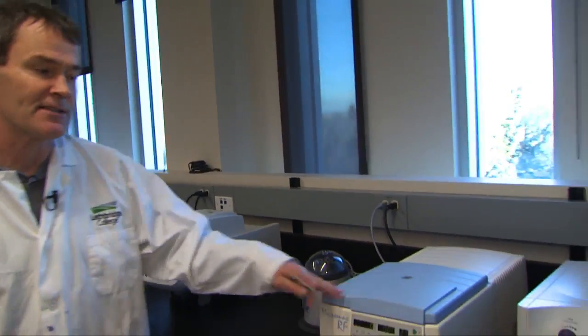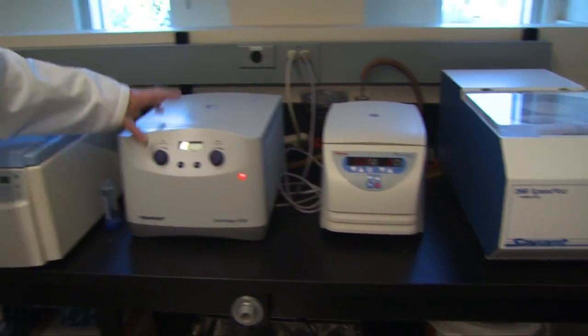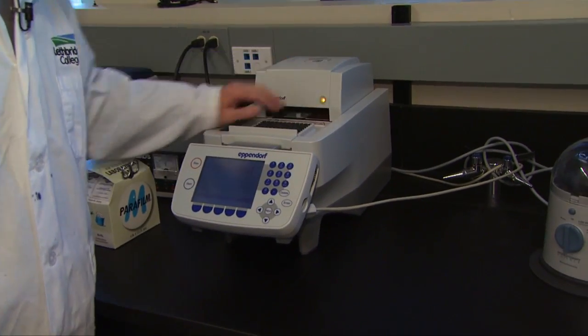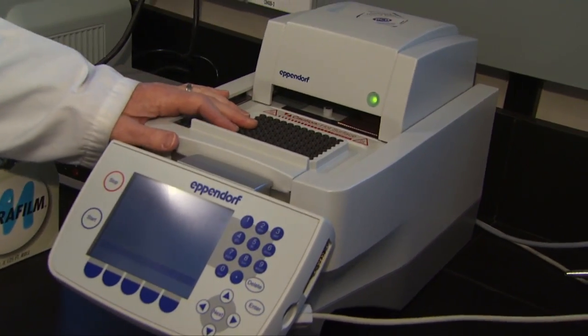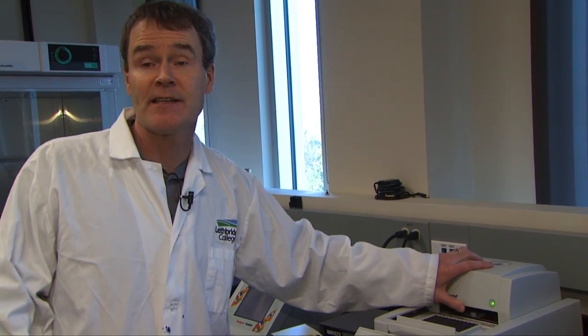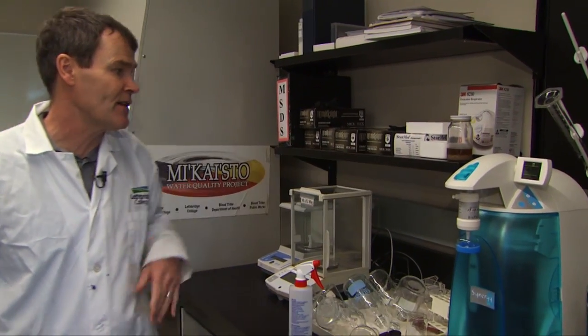This is the biotechnology section. You can see we have all the equipment that we need. We have a lyophilizer, some microcentrifuges, and several gradient PCR machines. This one allows us to test up to 96 samples on a PCR. So if you get the opportunity to use this, we can amplify certain segments of DNA, which will allow you to detect different pathogens like E. coli and Salmonella using PCR. We again have biohazard hoods and water treatment facilities.